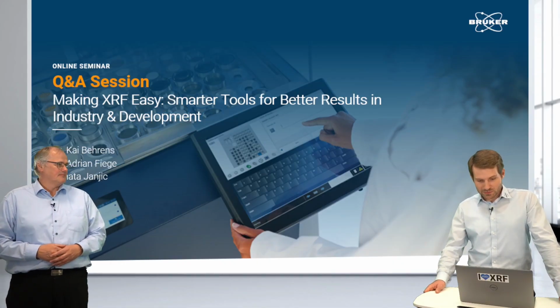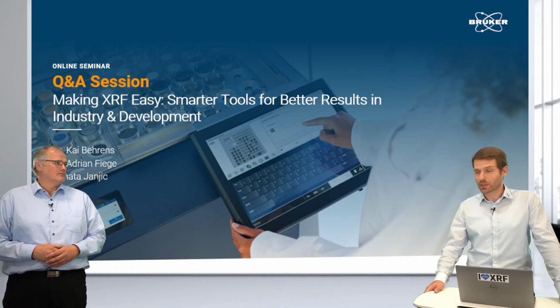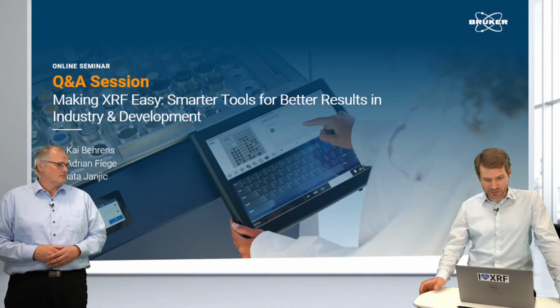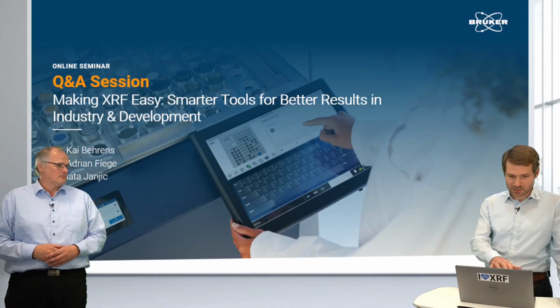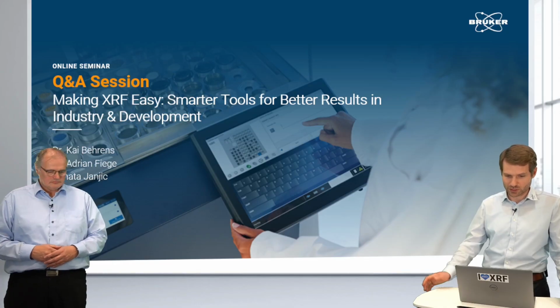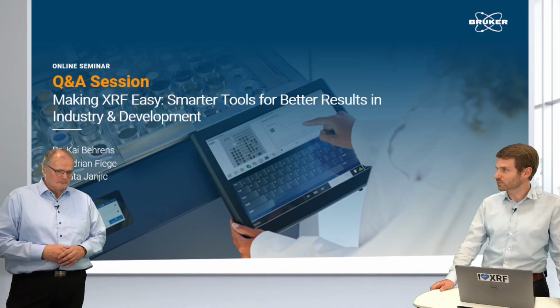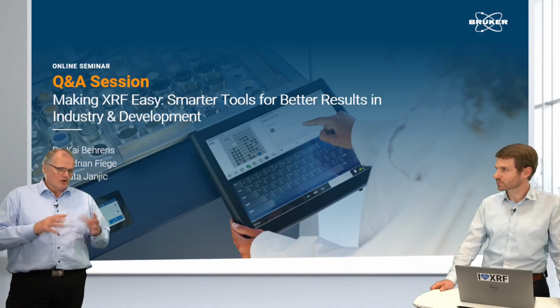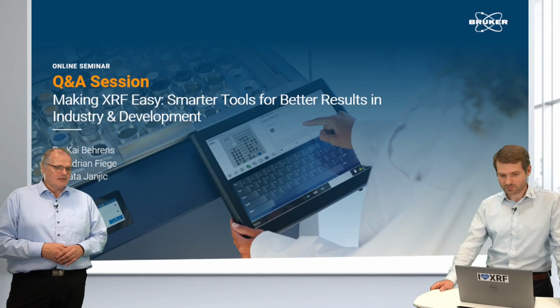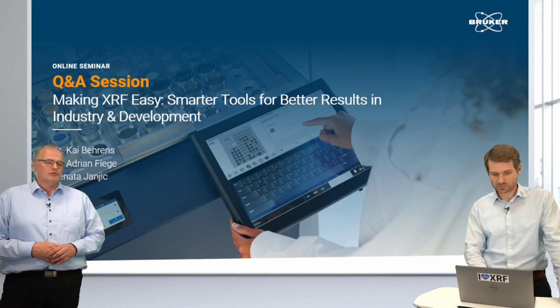Yeah, so we've received a couple questions both during the webinar as well as before, and we'll focus on some of them here. The first one: we analyze raw materials for cement production with a more general program. How would these functions that you described help us? Yeah, of course, I could envision that especially the sensor boost is pretty cool for raw mix.